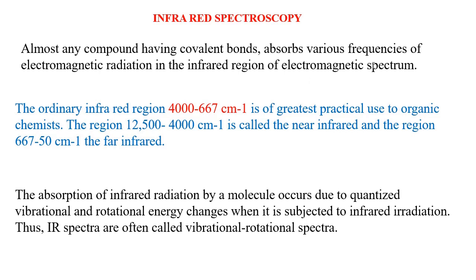Here we will discuss different aspects of infrared spectroscopy, such as what happens when molecules absorb infrared radiation, what are the different types or modes of vibration or fundamental vibrations, what are the factors which complicate the IR spectrum, and how the vibrational frequency is calculated using Hooke's law, and how the IR spectrum is used to determine functional groups and the molecular structure of organic molecules, etc.